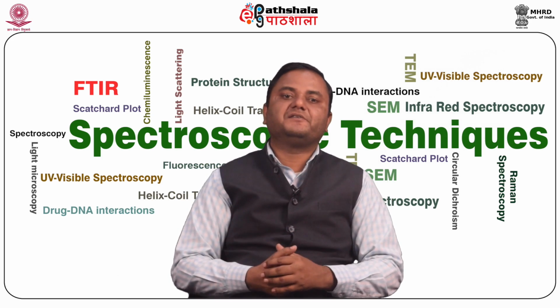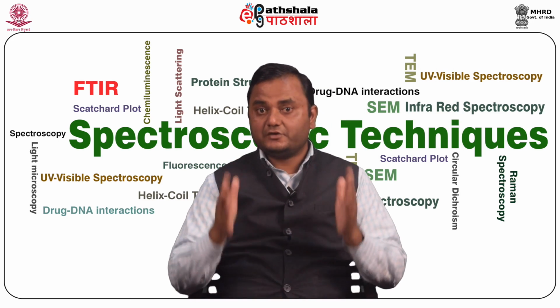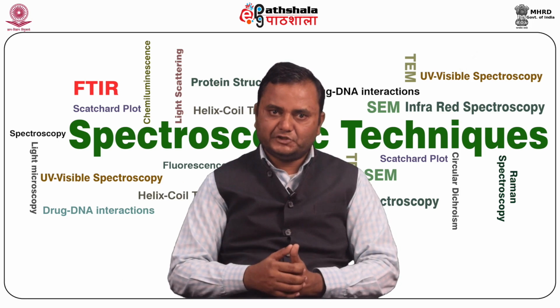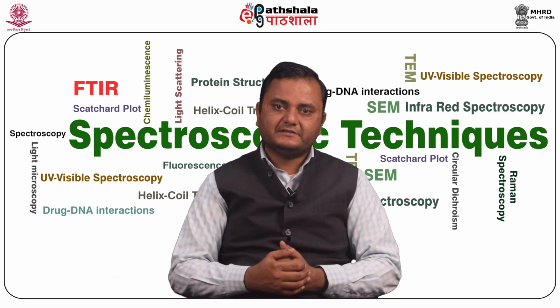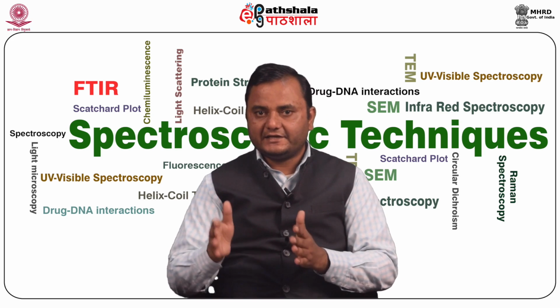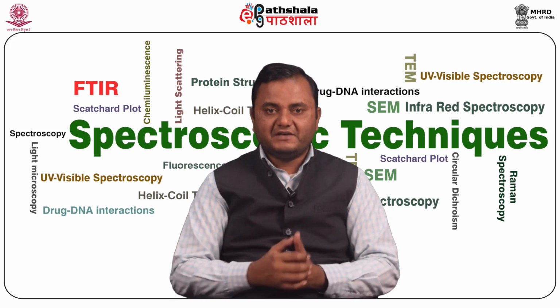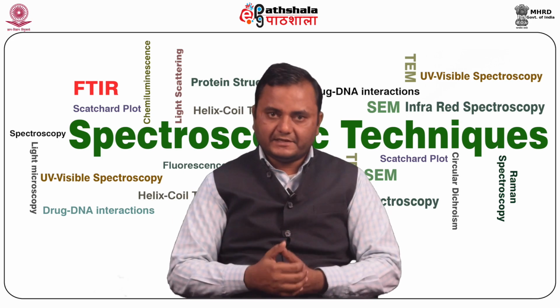The second advantage of FTIR is the Connes advantage. That's the high resolution, reproducibility, and highly accurate frequency determination. This technique allows high speed sampling with the aid of a laser and its interference fringes. It requires no wave number correction and provides wave number to an accuracy of 0.01 per centimeter.